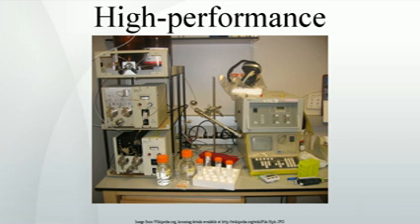SEC works by trapping the smaller molecules in the pores of a particle. The larger molecules simply pass by the pores as they are too large to enter the pores. Larger molecules therefore flow through the column quicker than smaller molecules, that is, the smaller the molecule, the longer the retention time. This technique is widely used for the molecular weight determination of polysaccharides. SEC is the official technique, suggested by the European Pharmacopoeia, for the molecular weight comparison of different commercially available low molecular weight heparins.